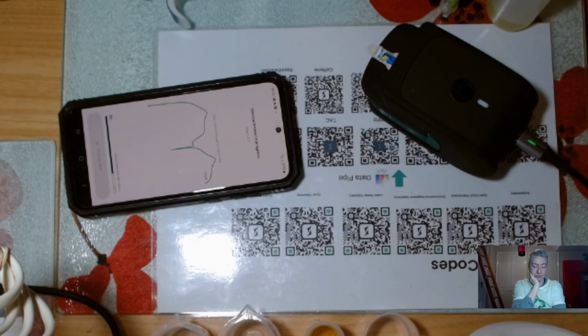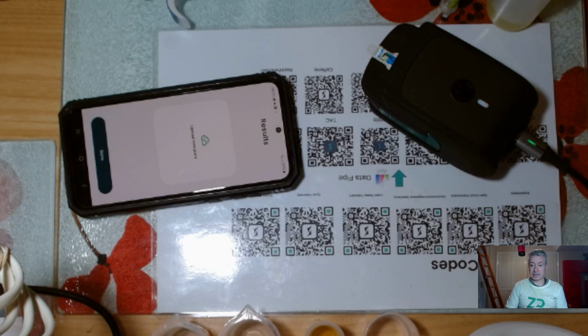And I think it's actually quite useful to sometimes see your cyclovoltammetry as current versus time. And the time it takes is obviously proportional to your scan rate.